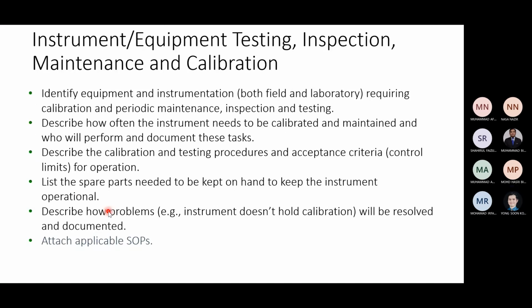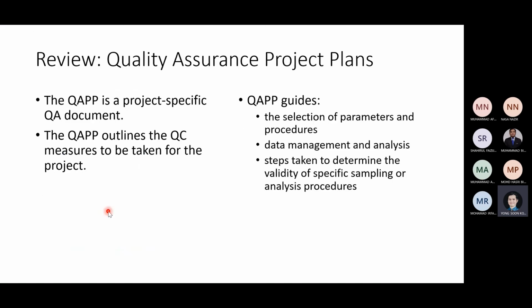Another set you can see here is not questions, it's a list: what to do and what not to do during the maintenance and calibration of instruments. But this one may not be applicable to sampling, so you can read it yourself. And so, once you have performed all these QC procedures, then you already know how good the QC procedure is, whether they are accurate or not.